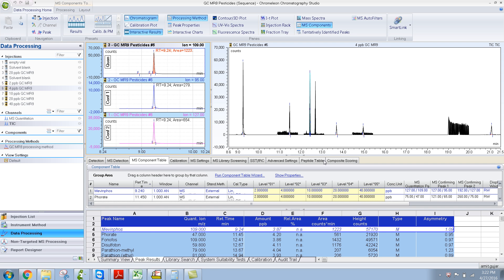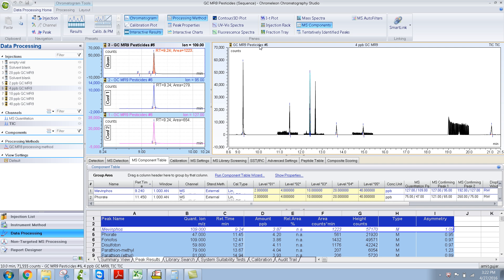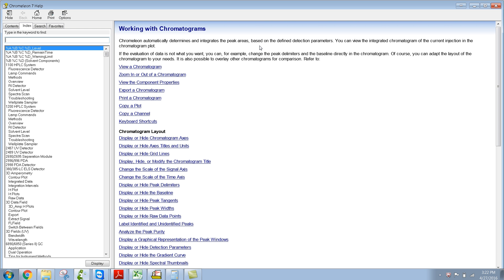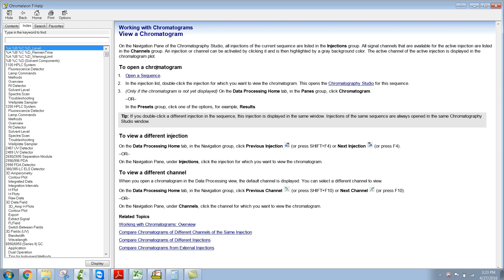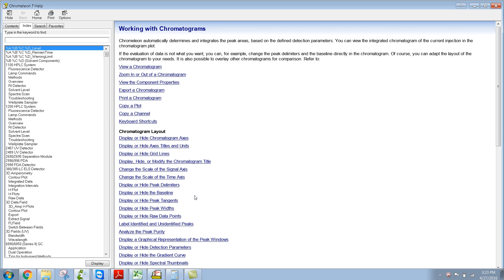The first useful function key is F1. In many softwares, F1 is the help key, and it's context-related help. Depending on what you need help with — for example, if I click over here on the chromatogram pane and press F1 — I get the Chromelion 7 help pop-up with help related to the chromatogram pane: how to view a chromatogram, and you can further explore each of those menus.